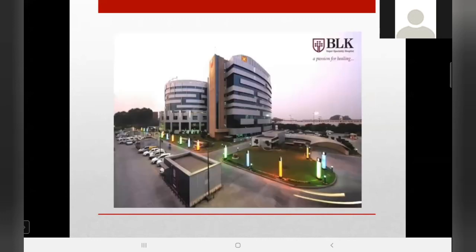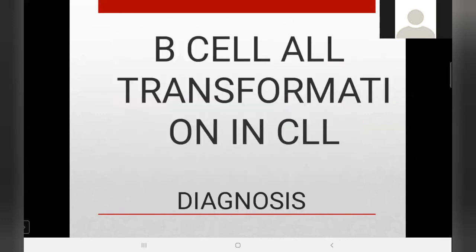Yes, ma'am. Okay. So this was basically an approach to acute leukemias, how you do gating, how you actually identify the blast. This is for you to have a very basic concept about identifying the disease. If you have any doubts, you can of course ask me.